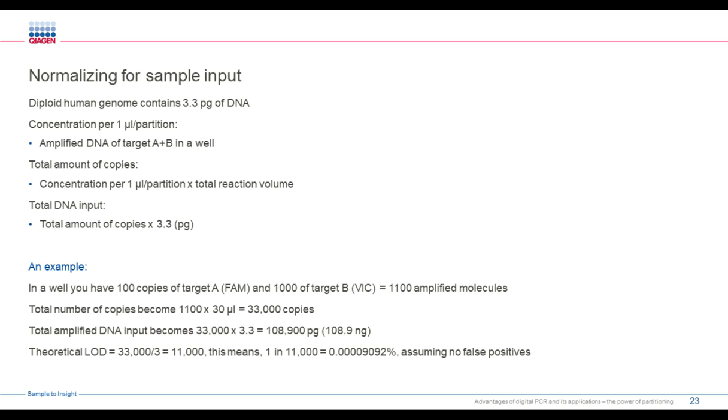Of course, the false positive rate is something you need to consider if you look for mutations. What you need to do then is screen your assay with wild types. You need to screen at least, I would say, a plate with the wild types to see if you have an assay-specific false positive rate. And this means that these false positives should come up randomly in the wild type. If they are just coming in one sample, then this is not a wild type anymore.